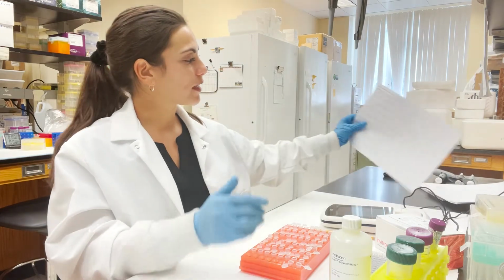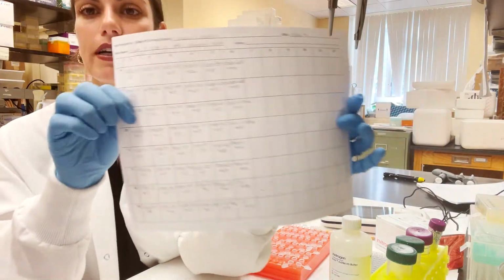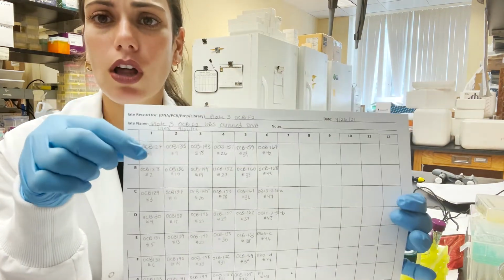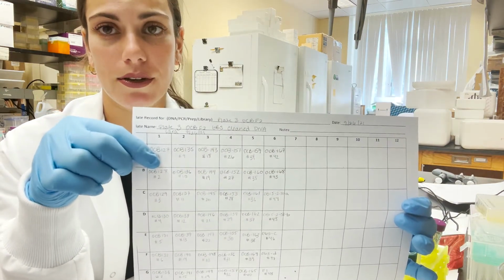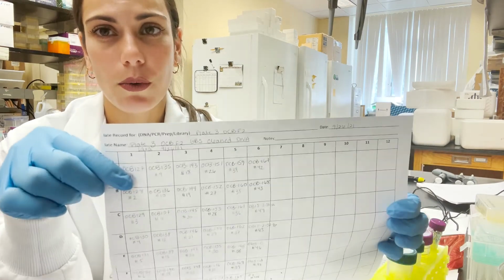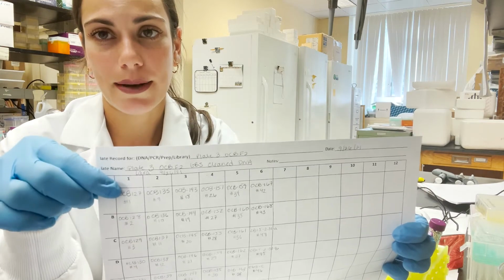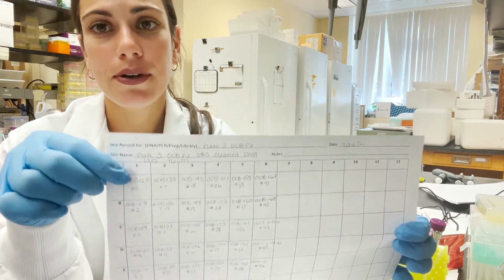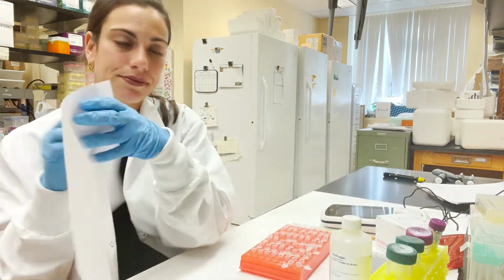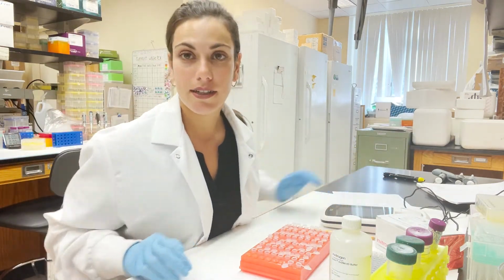And I write all of these numbers on a plate record. So here I've already written down every one of my samples, along with their unique barcode adapter, so that if I have to redo any of these samples, I can immediately know what barcode I have to put in, what sample it is, and what well it's going into. And I'll add the concentration below that so I can fact check it later. Okay, let's get started.